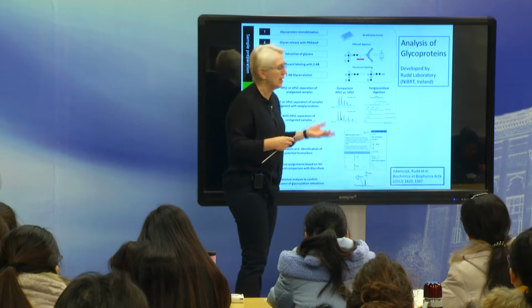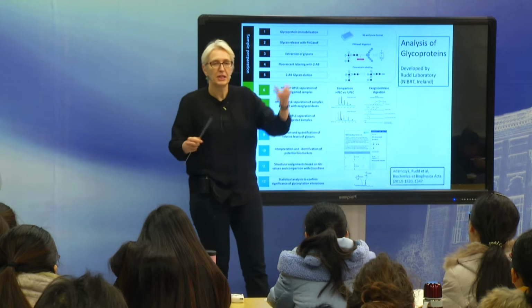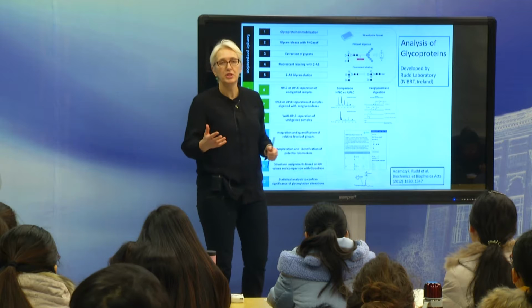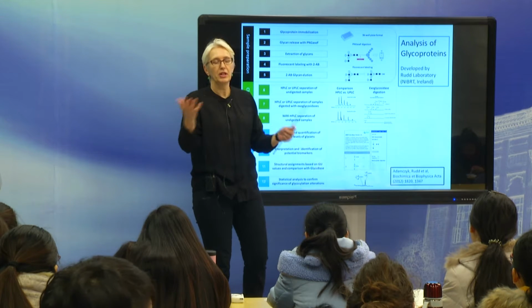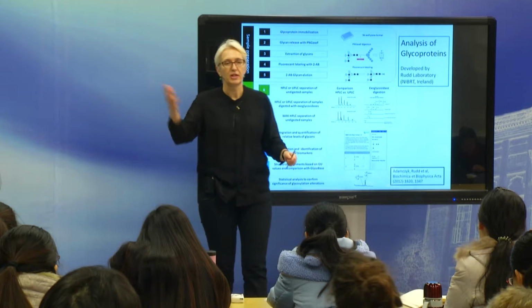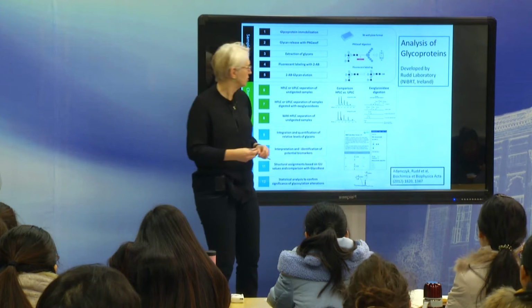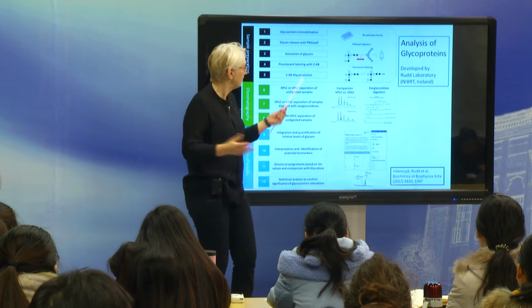you're exposed to enzymes that cleave specific sugars off from the end. So you do your hydrolysis with enzymes, and the enzymes have a certain specificity, and if a certain glycan gets hydrolyzed by a sialidase here, which is this one here, then there's a sialic acid at the end. If it's by a glucosidase, it's a glucose and so on. You can imagine quite a tedious process, but very effective.